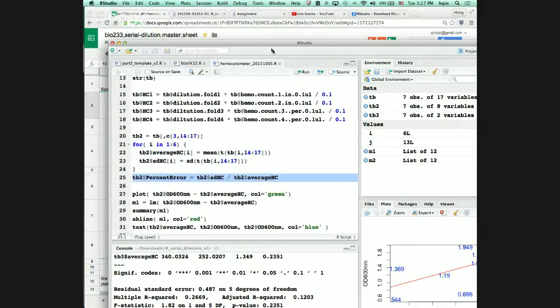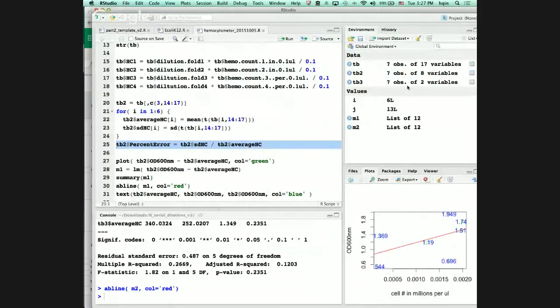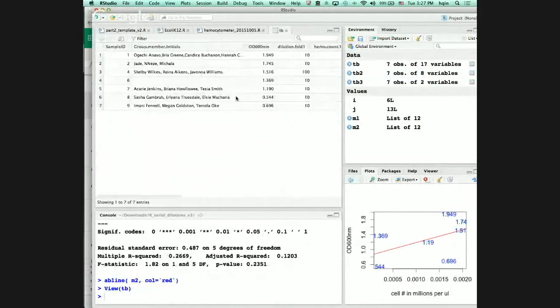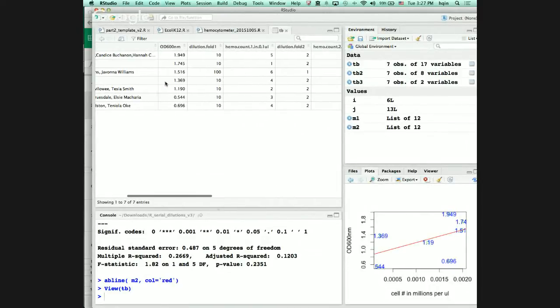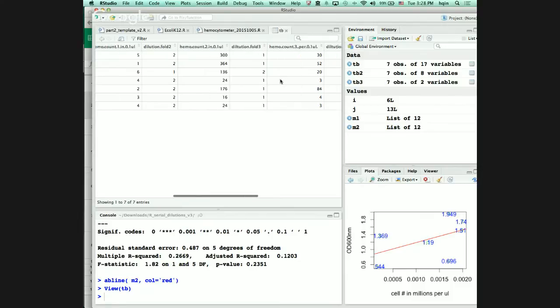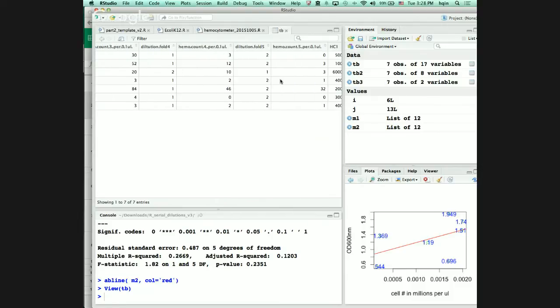Let me see. If you click on the right panel, you will see that's your Excel. There's actually one group that still hasn't put their name there. That's your OD value. So there will be 1, 2, 3, 4. There are 4 pairs of data.